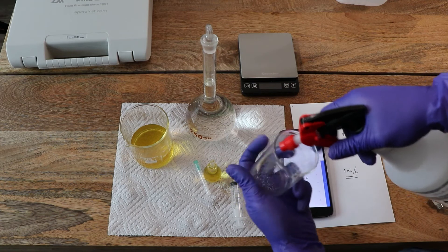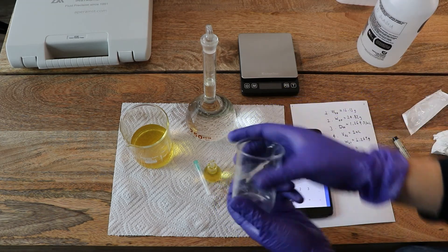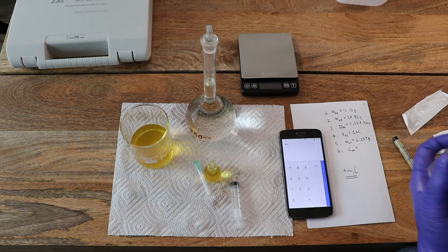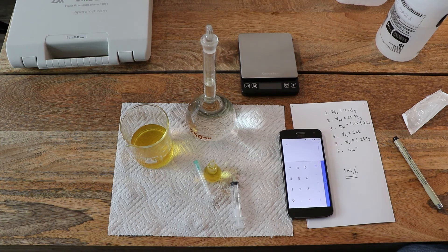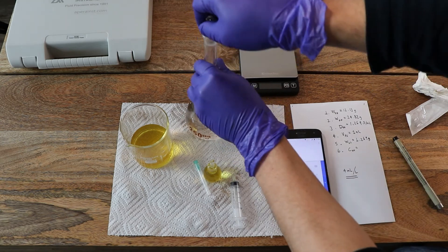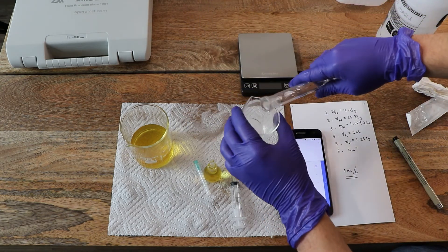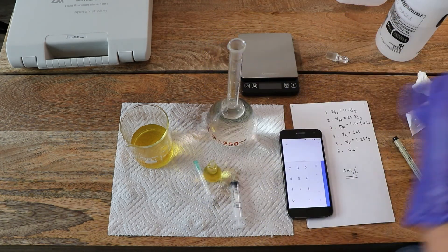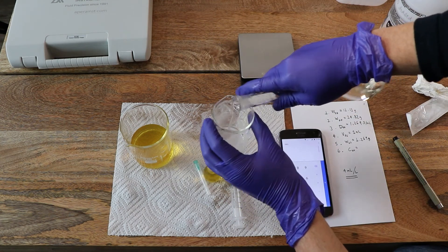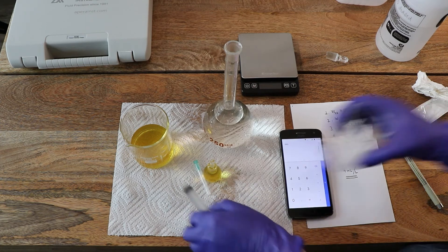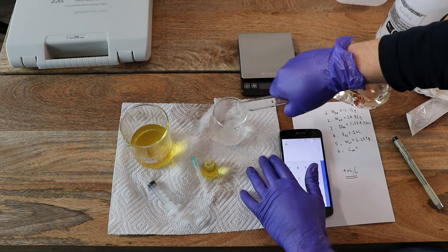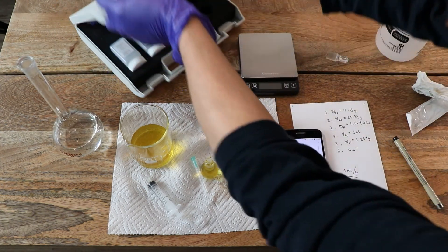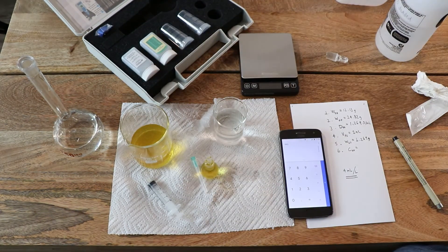Now I'm going to purge another beaker so that I can measure the conductivity of this diluted solution. First I'm going to purge it with distilled water because it has residue in it, and now I'm going to purge it with the diluted solution to ensure that I don't measure the conductivity of distilled water. Now I'm going to add enough solution to measure, and I'm going to take out my previously calibrated conductivity meter.